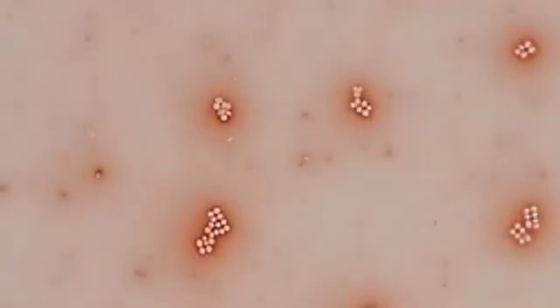Let it settle. There we go. Now you can see nice little clumps, which is typical of this species. And you can see that the cell itself is not stained. The cell is clear, but around it is the negatively charged stain of Congo red. Now let's see what the bacillus looks like under Nigrosin.